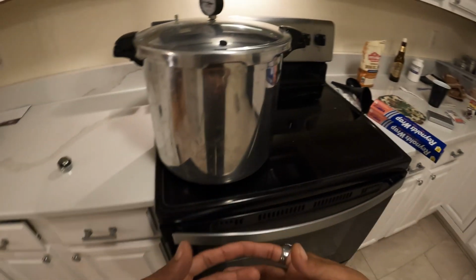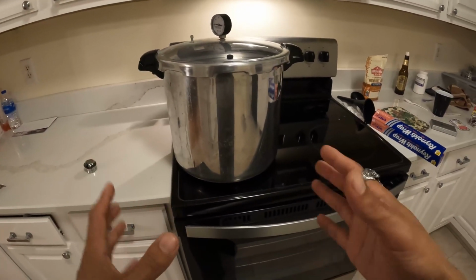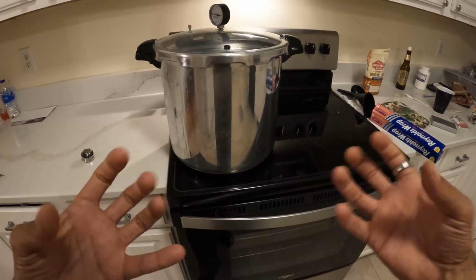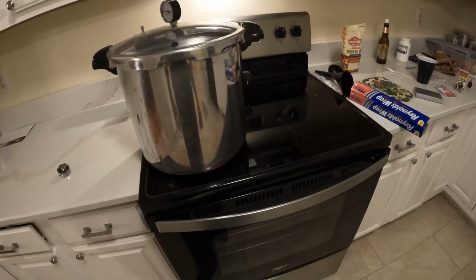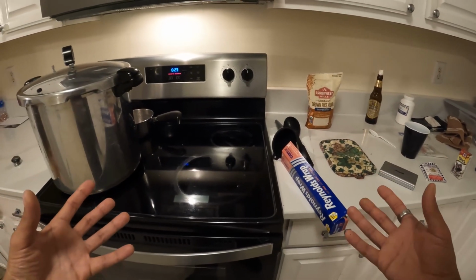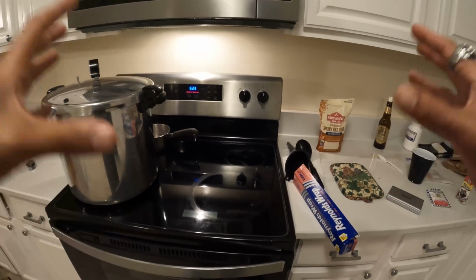And then you have to wait for the agar to cool to roughly 117 degrees to 123 degrees, and it's ready to pour. And that's warm to the touch. Roughly, it's still a little warm, so don't burn yourself. We'll go over all that in other videos, but I wanted to show you guys the process of making the agar. Two different recipes, two different ways.